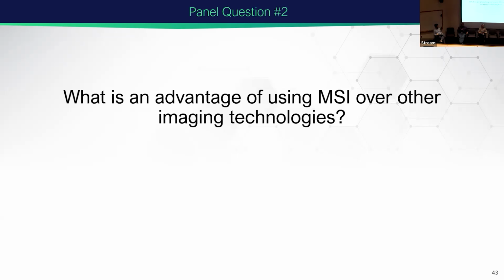No, that definitely does, actually. It's a very unique perspective too, because bridging from a lot of these larger molecules to the atomistic portions, you can get a lot of information just by doing these targeted experiments that you can't necessarily do unless you're actually looking at these isotopes and doing these isotope tracing experiments. So that's very, very nice. Youngjin, I'll ask you the same question.